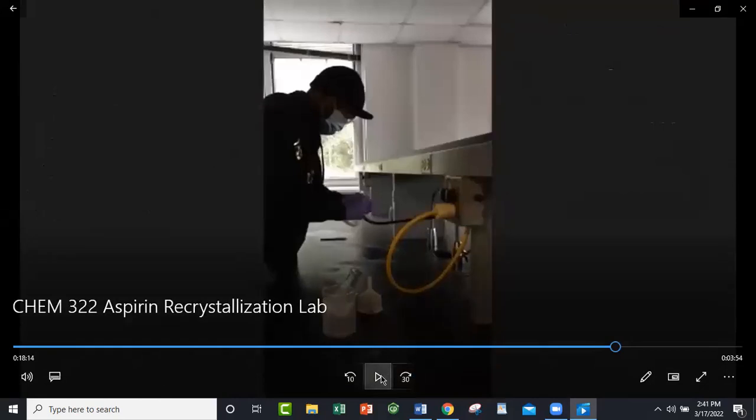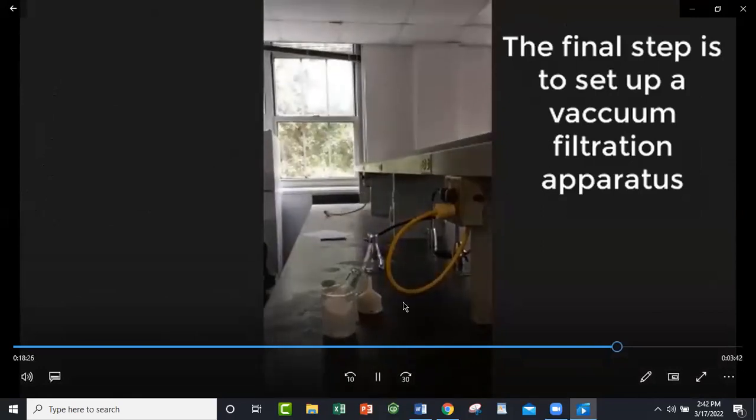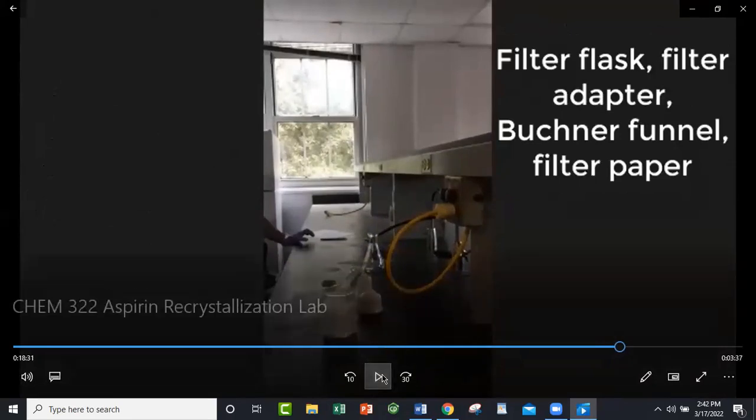So we saw this last week, the vacuum filtration setup. Normally we clamp that down because those hoses have tension in them, and I've seen those things turn over and break. So it's just a filter flask, connected to an aspirator on the sink. You need a Buchner funnel with a piece of filter paper in it and a piece of rubber tubing to connect the filter flask to the aspirator. And really that's it.